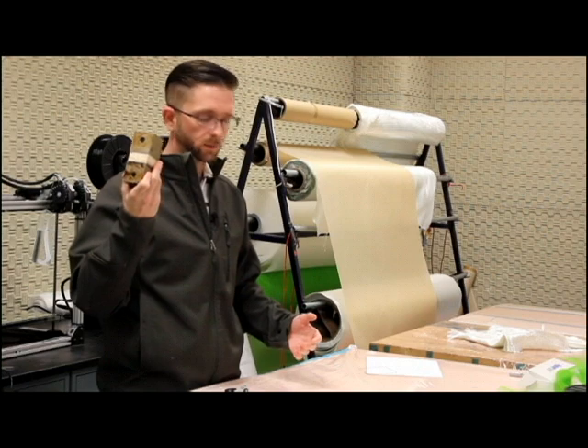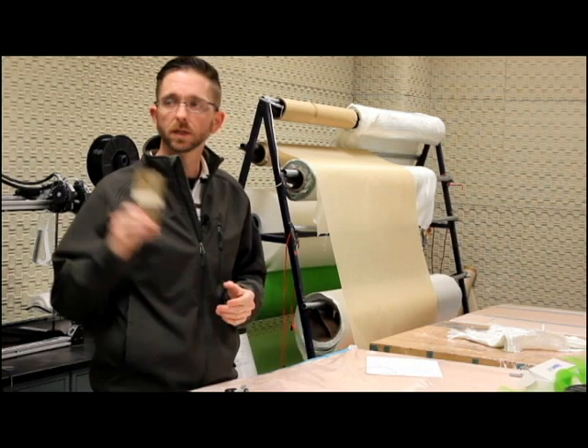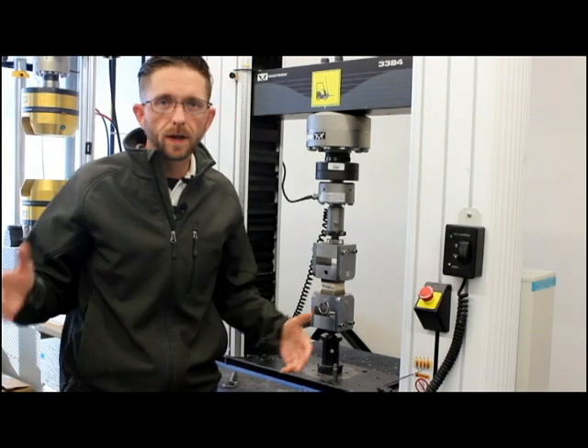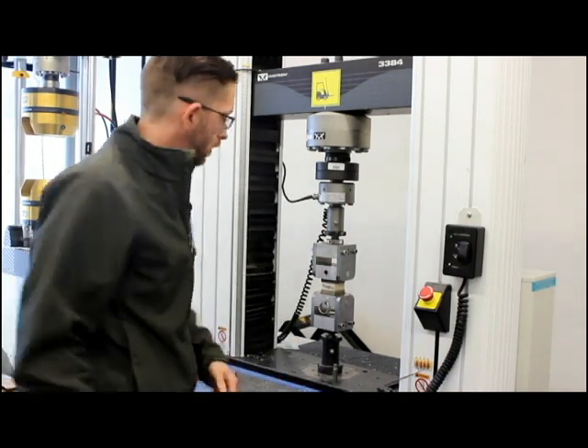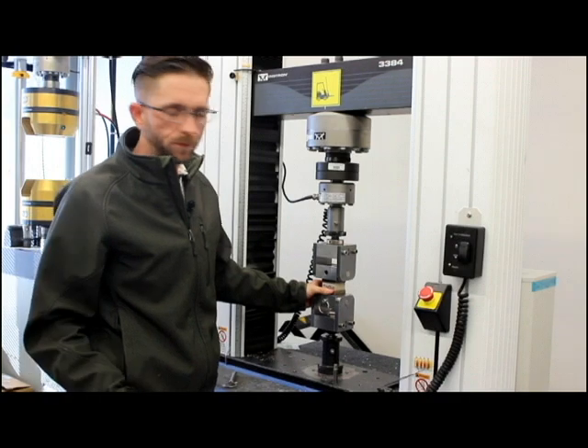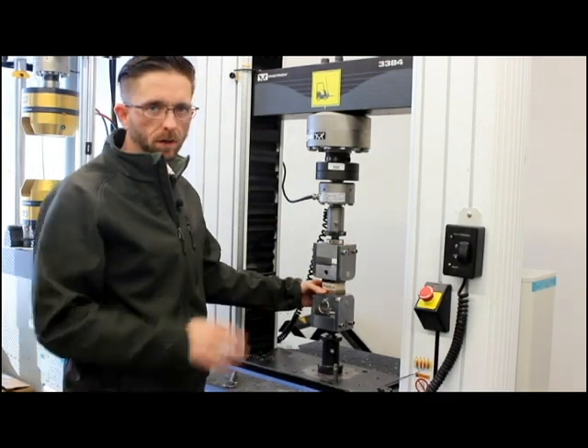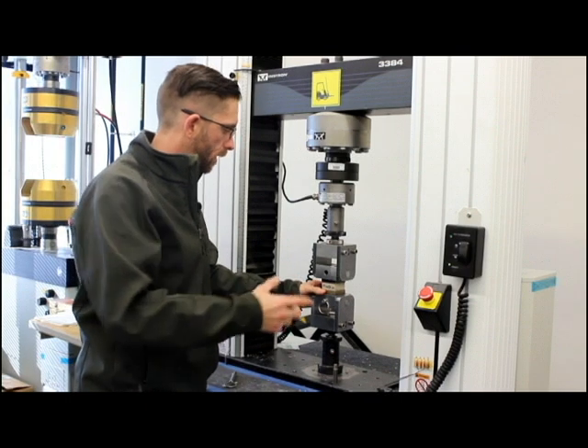This specimen right here is ready to test, so we're going to go over to the machine and show you how it's done. We are now finally ready to perform our test. We have our specimen after all the preparation we've gone through — a label on the specimen, all the dimensions recorded: the thickness, the width, and the depth.